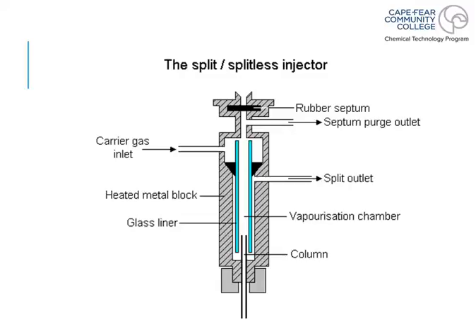This piece of rubber septum, that's what we've always talked about. There's my helium entrance that begins to mix with my sample. This blue bar to the left and to the right, that's supposed to represent the actual glass insert. So really, there's a bar to the left and right, but this is the actual tube that sits down inside of the injector port itself.